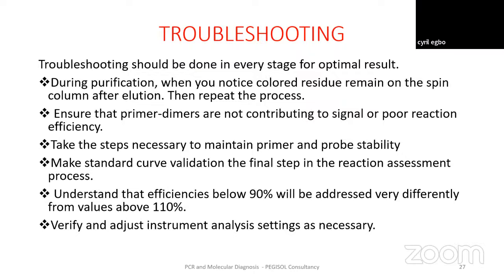Then you take the steps necessary to maintain primer and probe stability. Like the one I failed to mention when I was talking about the composition of the DNA template, for instance, GC-rich templates, there's what we call self primer.